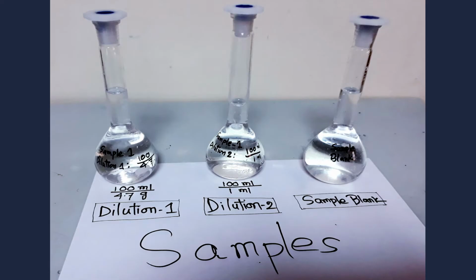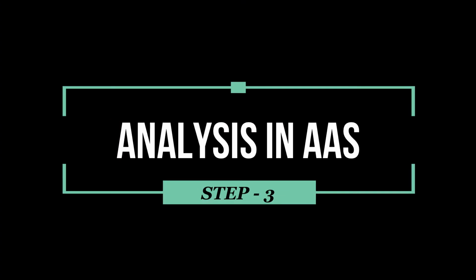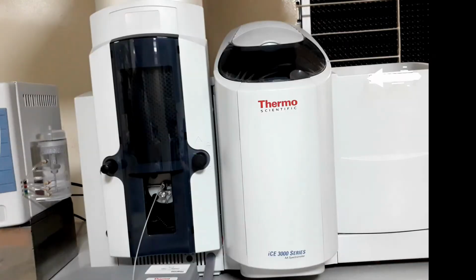Our sample preparation is done. Now we will analyze the prepared sample in AAS.